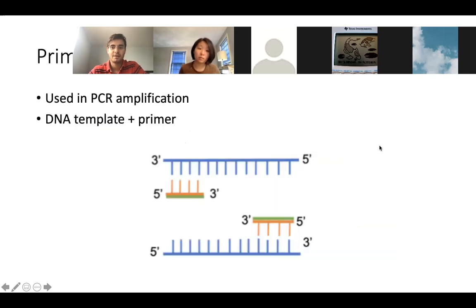All right, let's now move on to primer design. That's a basic. Did someone want to say something? Okay, primer design.